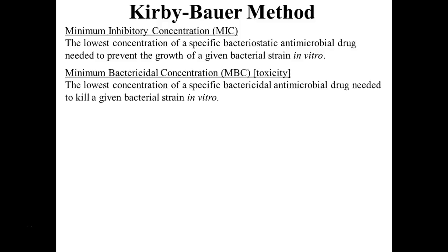Another term you'll see is minimal bactericidal concentration. This is the lowest concentration, again, cidal, that will actually kill that particular organism. So here, we inhibit the growth. Here, we're actually going to kill them.